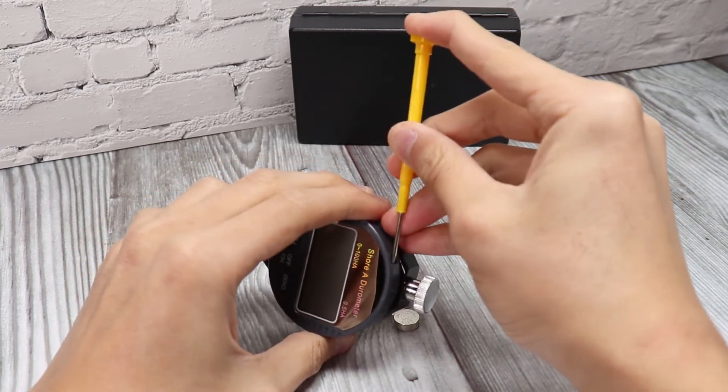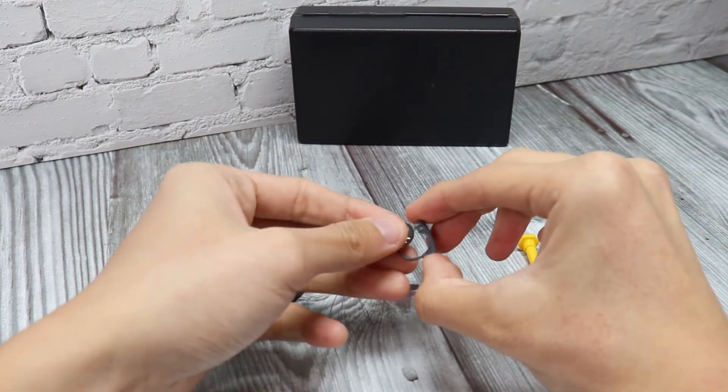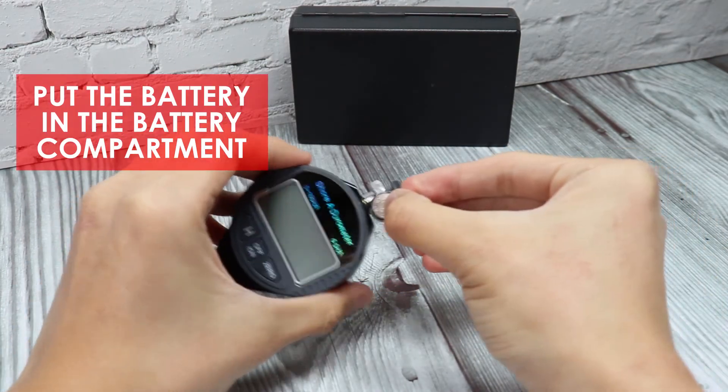To place the battery in the unit, take off the battery cover. Put the battery in the battery compartment and put it back in the unit.